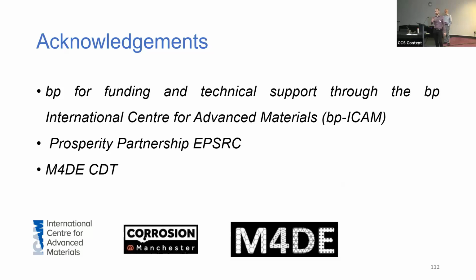And that's between the grinding and polishing steps. We then polish the sample afterwards, which reduces the mechanical deformation of the sample slightly, which helps a bit. It's still quite tricky because the AFM that we use doesn't have a good camera. So when we're trying to touch down on a specific point, I can get into that triangle, but I don't necessarily know where in that triangle I am. So taking it then to the SEM can be a bit time consuming. I think it took me about 3 or 4 hours to find that specific place.